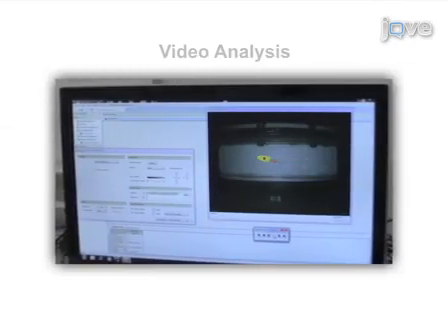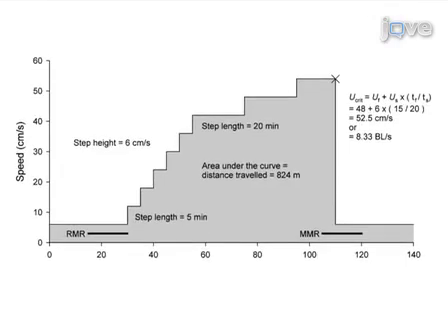Video analysis software can be used to obtain information related to swimming behavior. Results are obtained that show differences in swimming performance based on the top speed at which the fish could swim and the time it could maintain this speed. This method can help answer key questions in physiological ecology concerning the energetic demands of swimming and its controlling mechanisms.